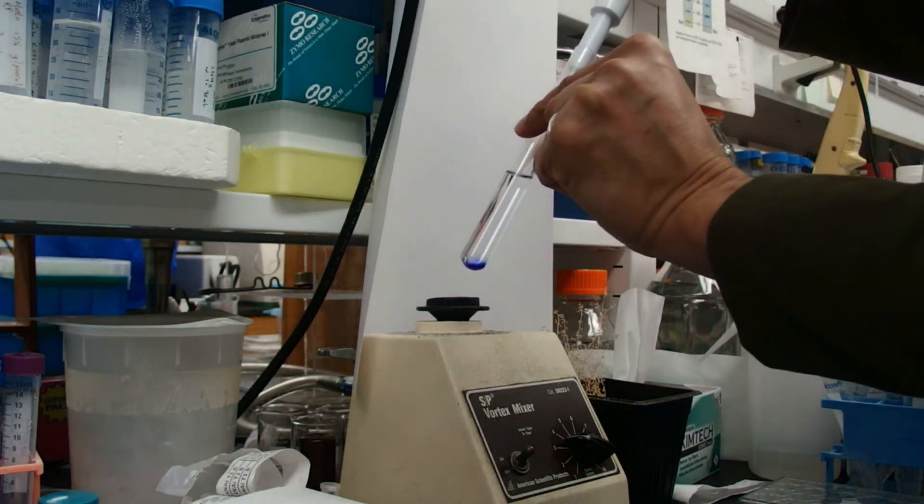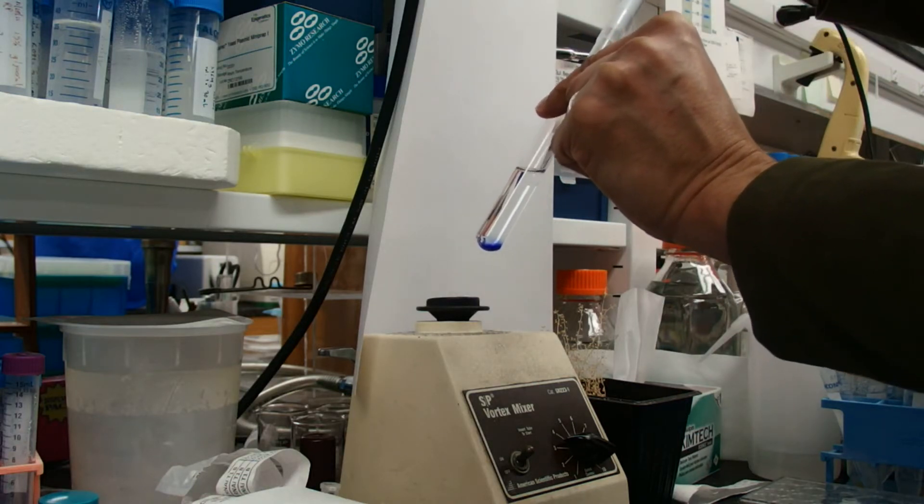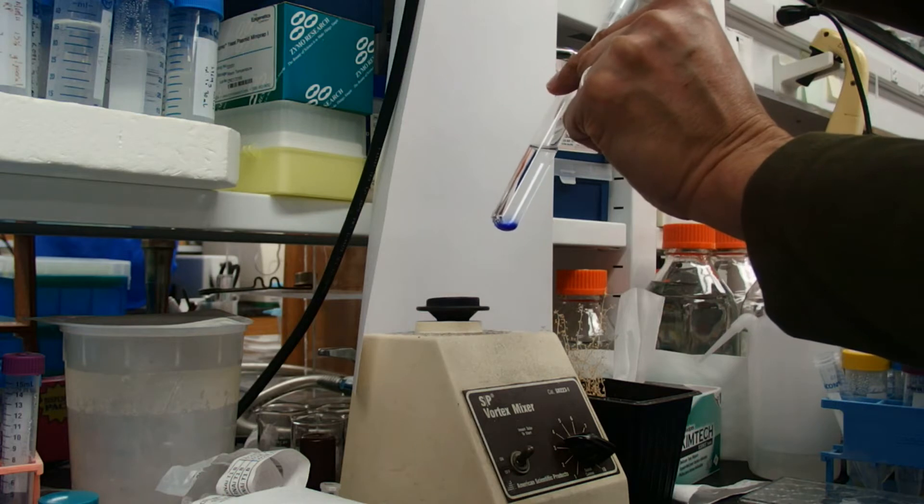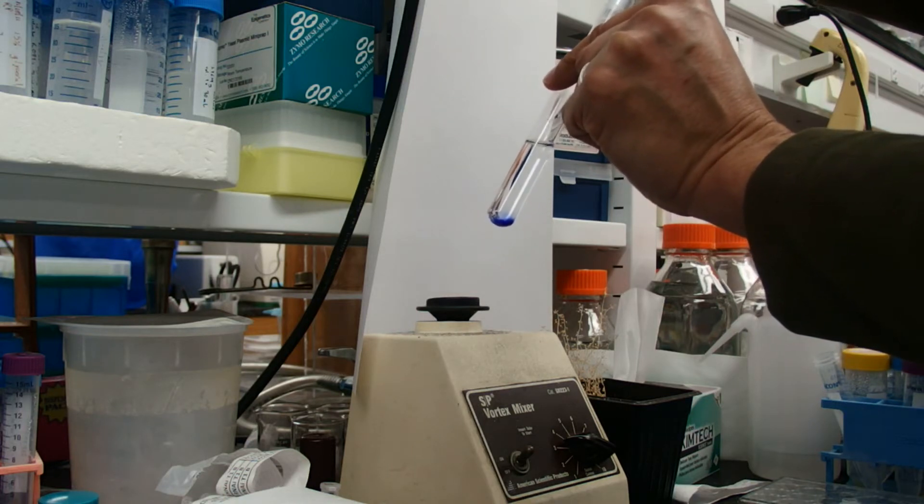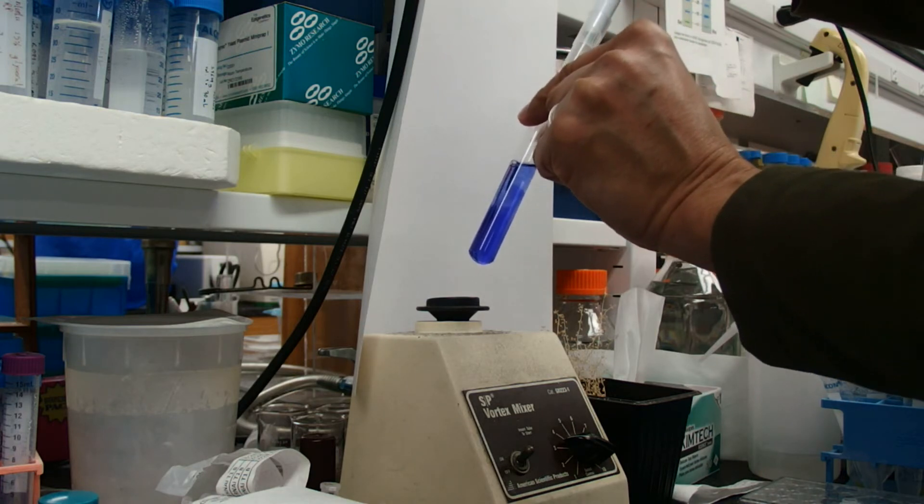To mix by pipetting, we're just going to pipet the liquid in slowly into the pipetter. Bring your pipet a little bit above the liquid and squirt it out hard. You see mixing has happened right there.